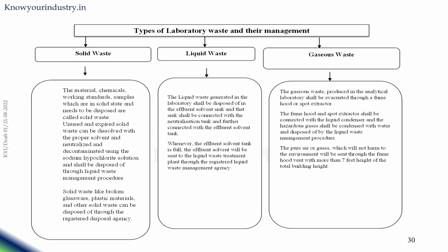So we have seen the wet lab as well as the instrumentation lab. Now we are doing a lot of analysis every day, and after the analysis there will be a lot of waste. So how does a laboratory manage this waste? There can be solid waste, liquid waste, and gaseous waste. How is solid waste managed?